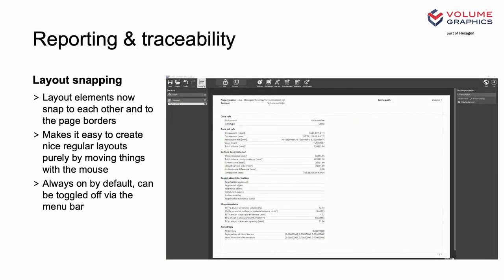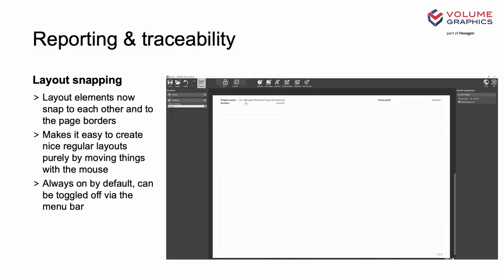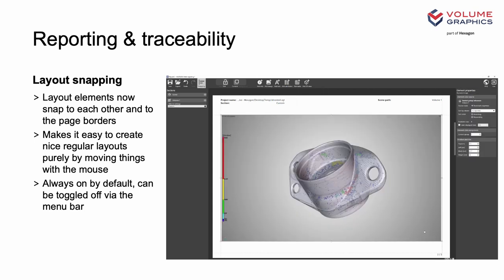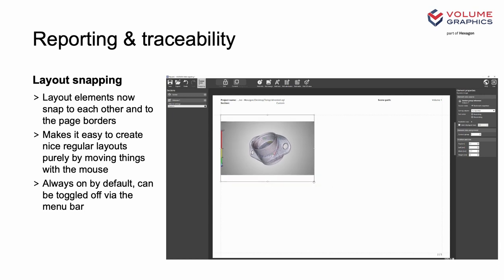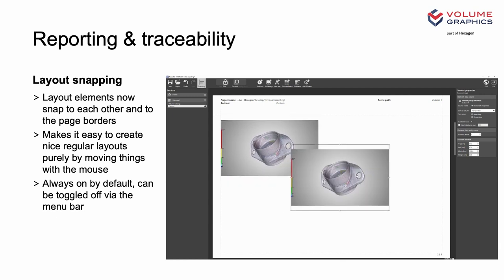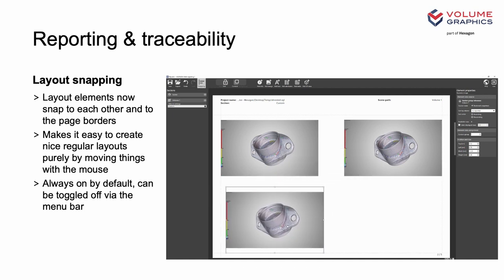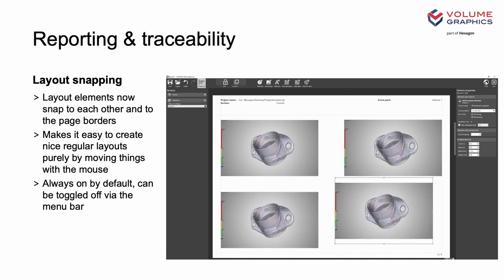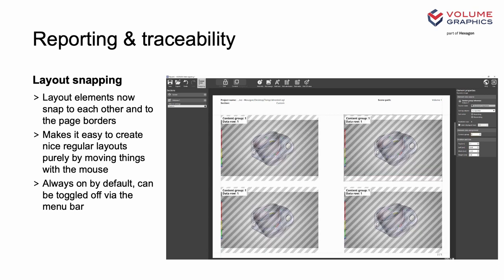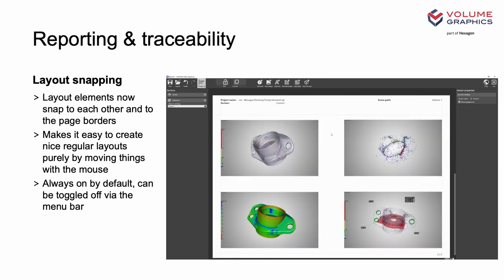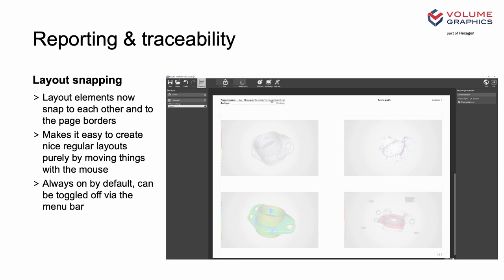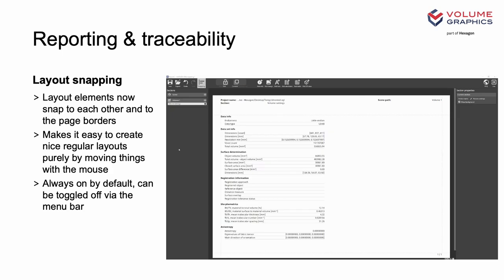We've had some amazing customer feedback about our new reporting tool. Despite the plethora of new possibilities within our new user interface, we're still looking to improve it. So now we've introduced snapping for the layout elements. This means that when you're introducing new elements such as tables, text, or images, as you move them around, they will now snap to locations. This means it's no longer as fiddly to get things to align to each other, and works similarly to other types of software that allow you to move elements around, like the software that may have been used to create this presentation. This snapping applies to both location and resizing, and is already on by default.